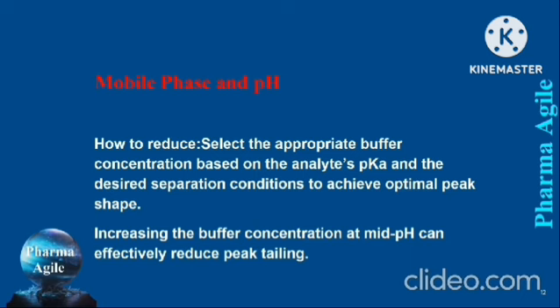Additionally, consider using alternative organic modifiers such as acetonitrile or methanol to minimize secondary interactions and improve peak shape.